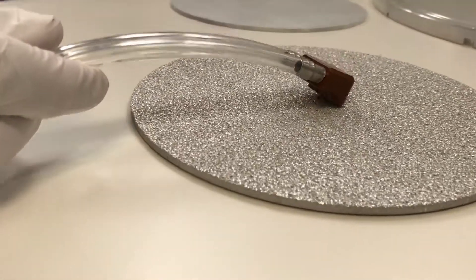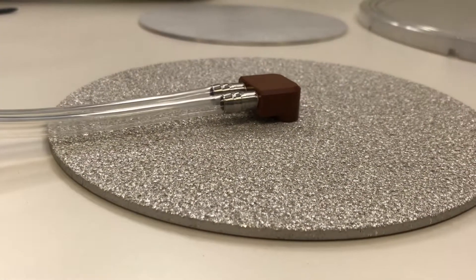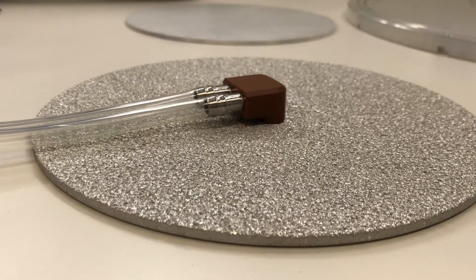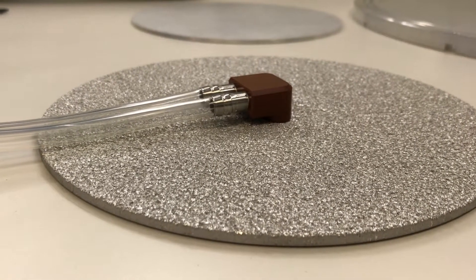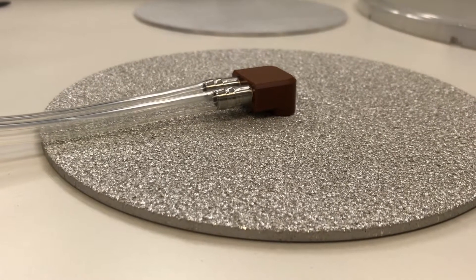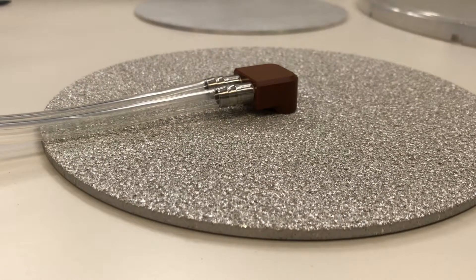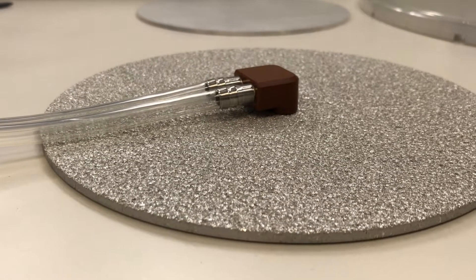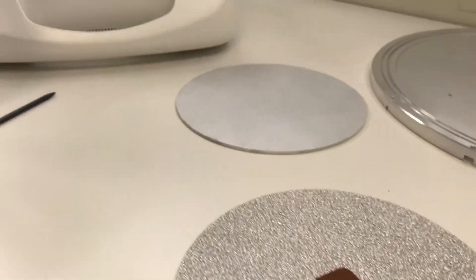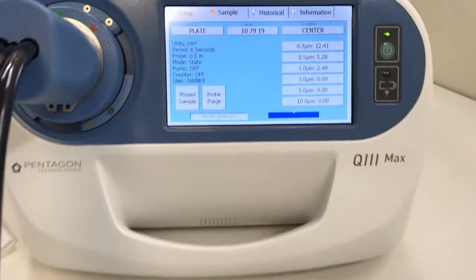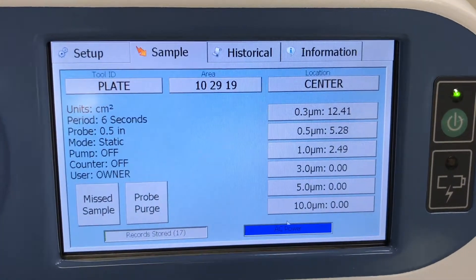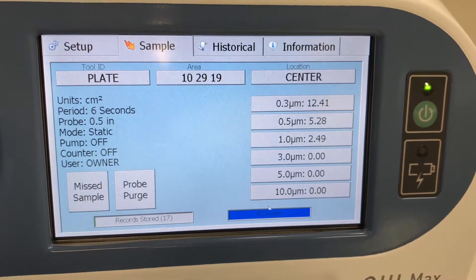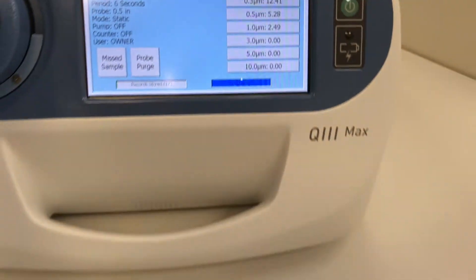After the blow off, we are placing the probe flat on the surface and making a second measurement. You'll notice from the results that the surface contamination has significantly reduced, down to 12.41 greater than 0.3 micron particles per centimeter squared in six seconds.